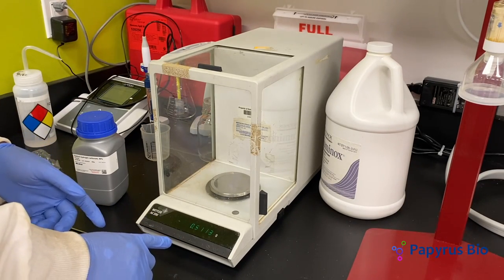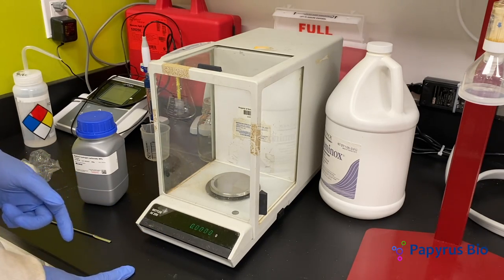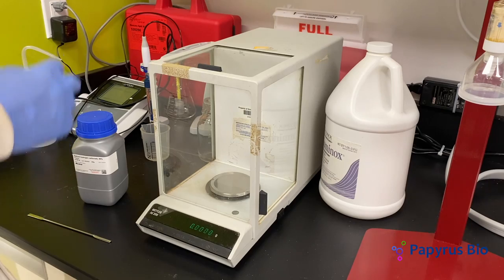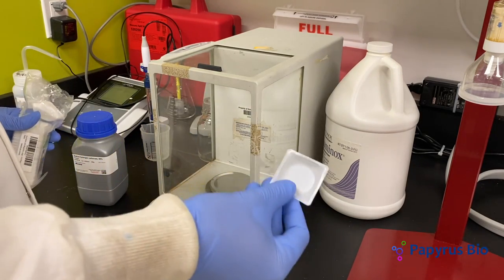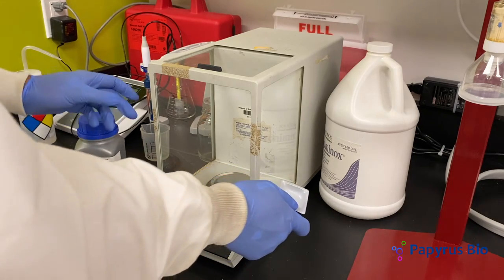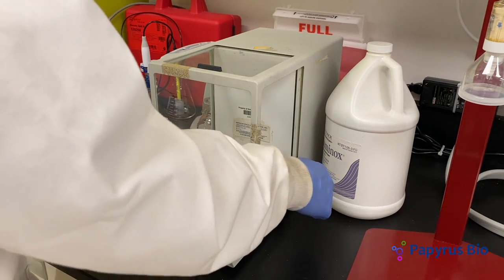Always start off by zeroing the scale by pressing the bar on the bottom. We weigh samples on these weighboats. Slide one door open and place a weighboat on the scale, then slide the door closed.